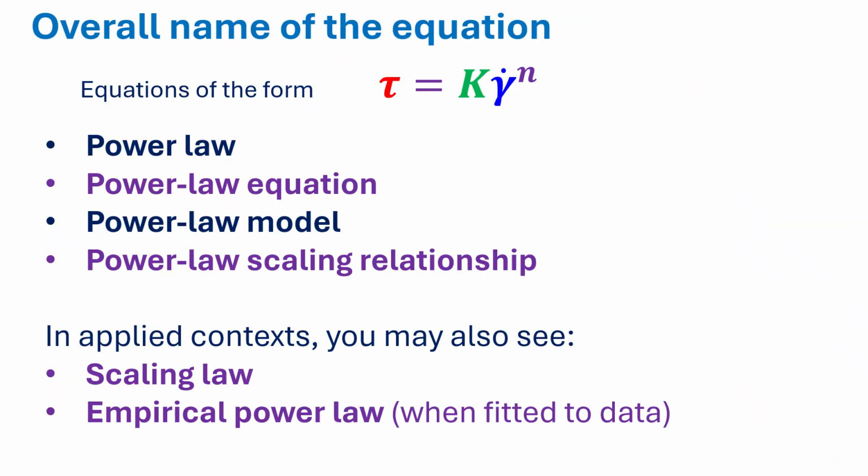One of the things I really wanted to emphasize with this is trying to relate rheology data to a nice simple mathematical model, and the most simple of all is really the power law model. That gives a lot of flexibility and describes an awful lot very straightforwardly.